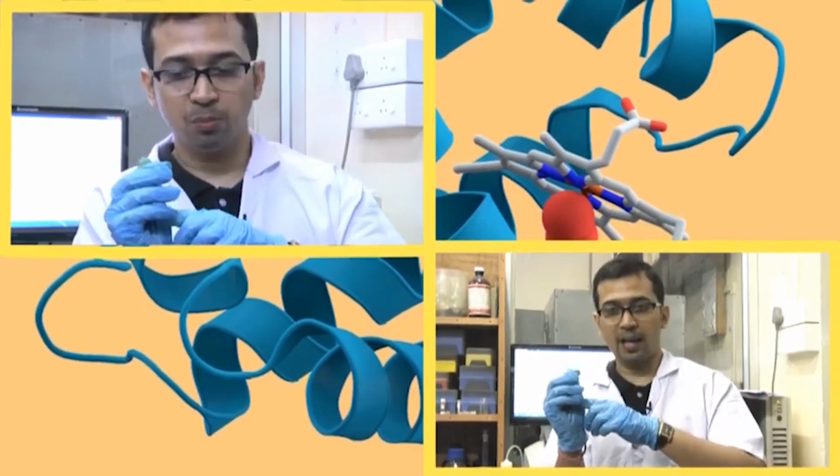Now, when this gallic acid is getting attached to this protein molecule, the UV light is not at all being exposed to this gallic acid.